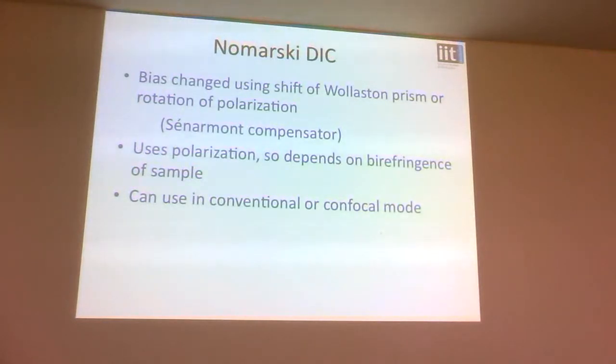And thus, how are you able to say for sure it is birefringence of the sample, like a phototransparent sample, or because of scattering? Yeah, I think there are all these problems. I've heard. Yeah. Okay, and you can do it in confocal as well as conventional.